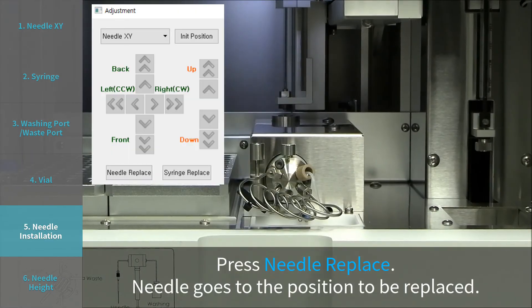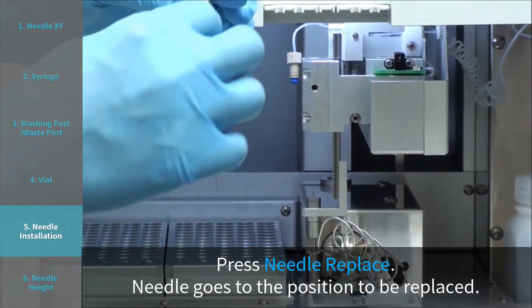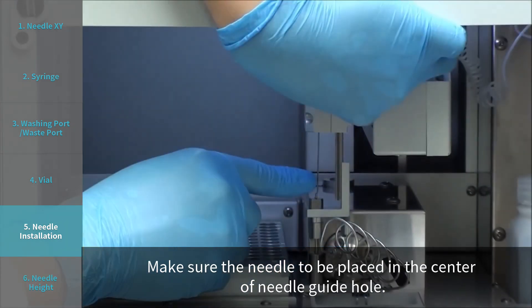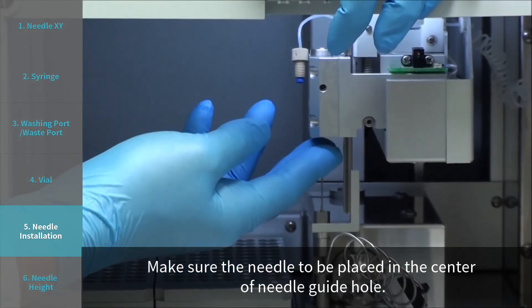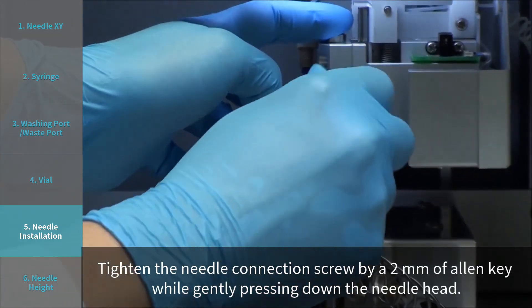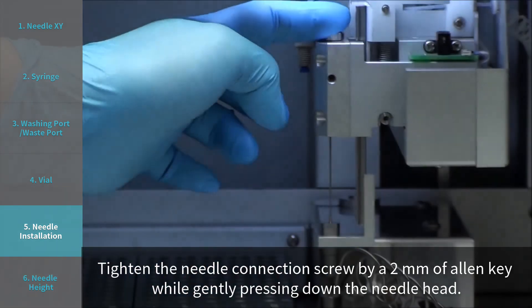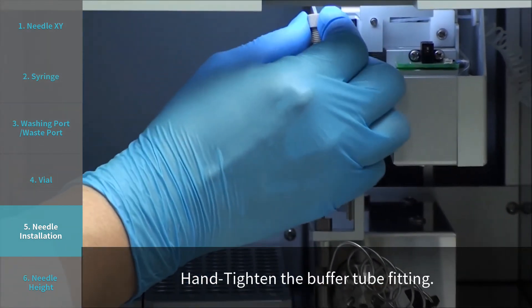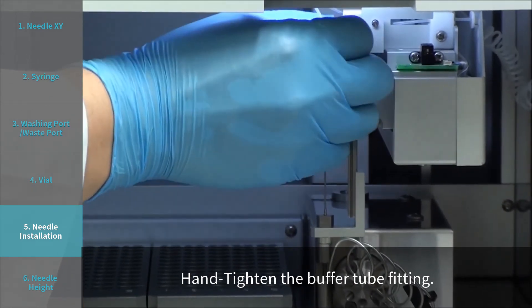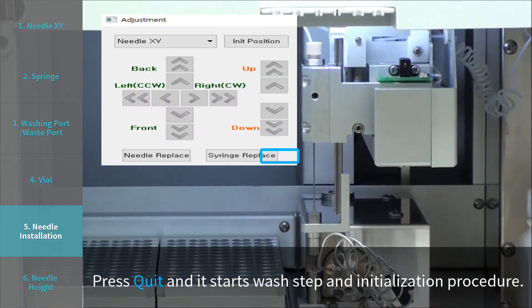Step 5: Needle installation. Press needle replace. The needle goes to the position to be replaced. Install a new needle, making sure the needle is placed in the center of the needle guide hole. Tighten the needle connection screw with a 2 mm Allen key while gently pressing down the needle head. Hand tighten the buffer tube fitting. Press quit, and it starts the wash step and initialization procedure.